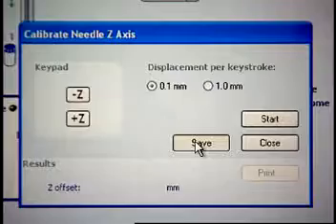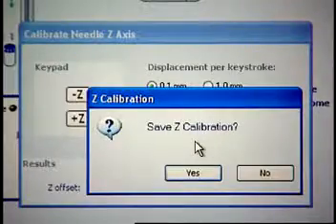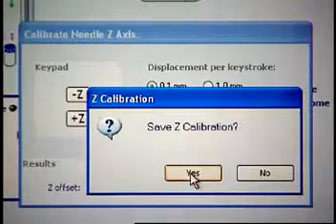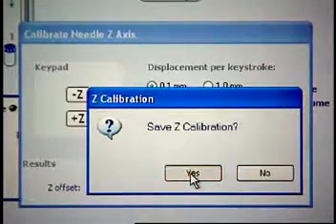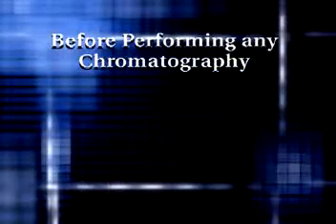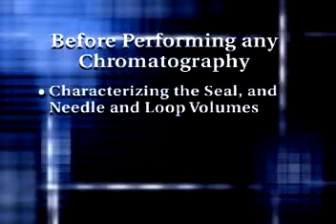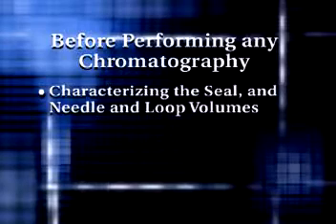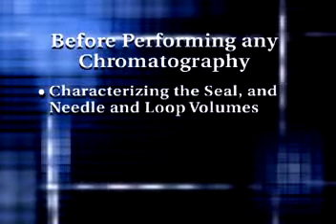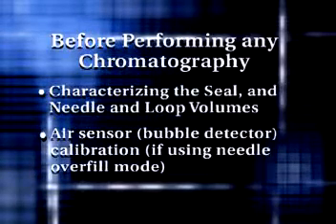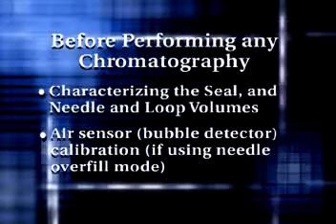Click Save. The confirmation window appears. Click Yes. Before running any chromatography, it will be necessary to perform the following procedures: characterizing the seal and needle and loop volumes, and air sensor bubble detector calibration if using needle overfill mode.